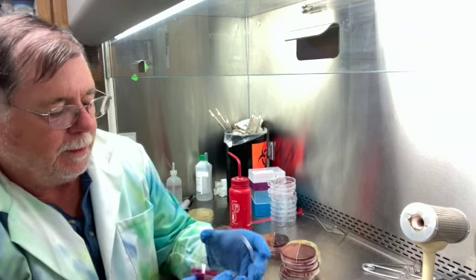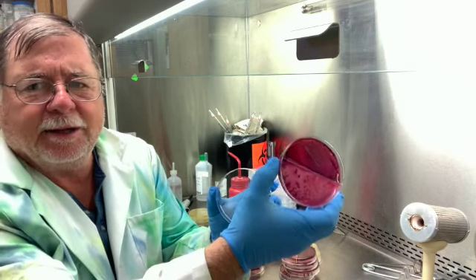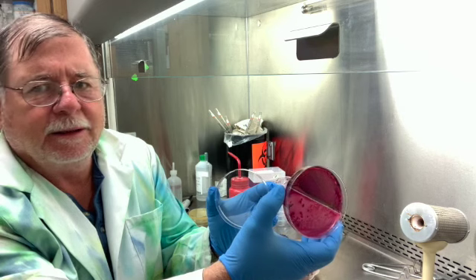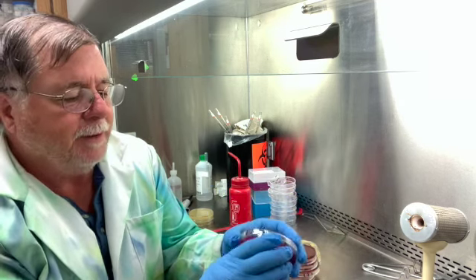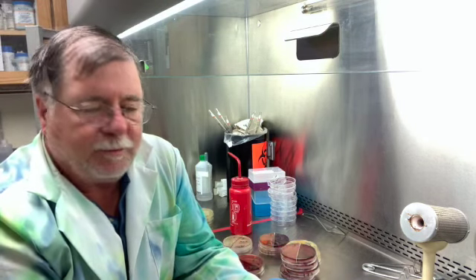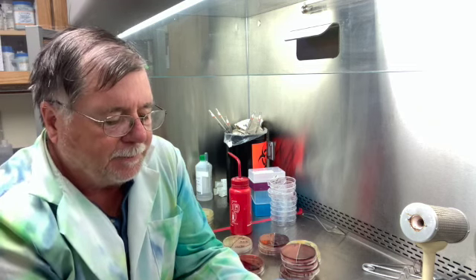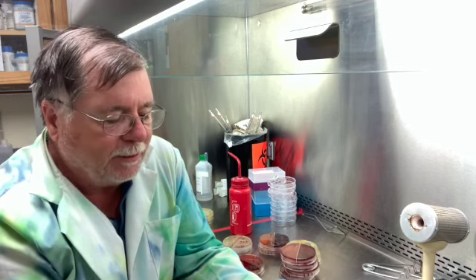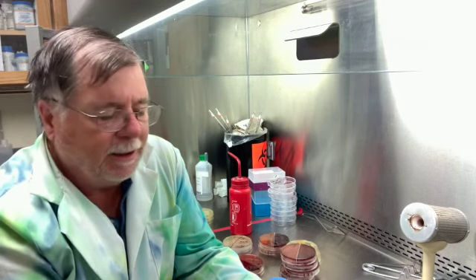So EMB, you can see that there's this green metallic shine, and that's characteristic of E. coli on EMB. Because it's fermenting the lactose and sucrose in the media, it can grow with this green sheen to it. And so that's characteristic of E. coli often. Not 100%, but it's a pretty good indicator.